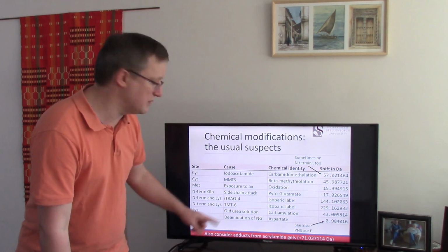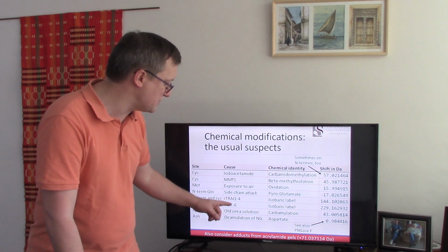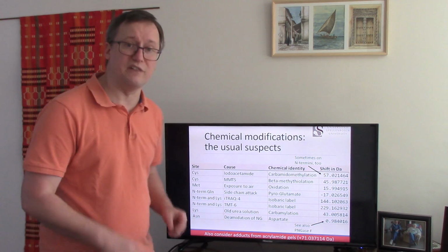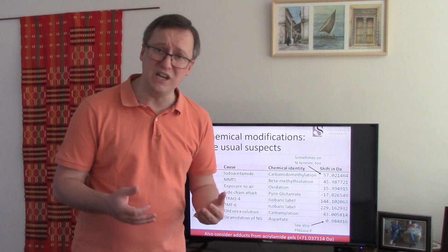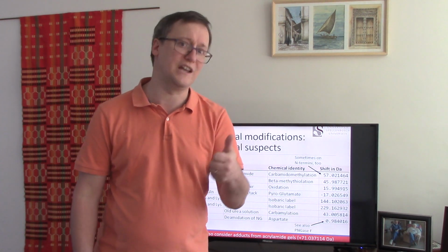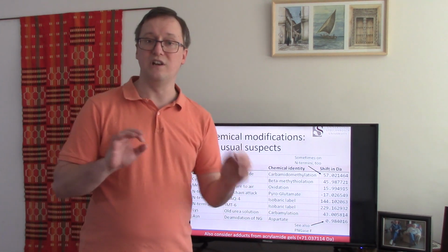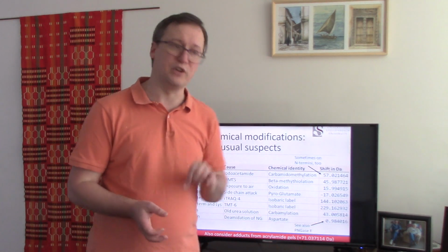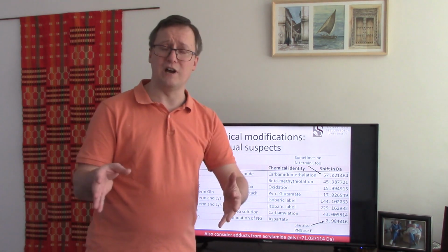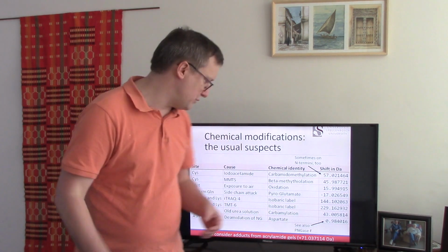Okay, we mentioned isobaric labeling for quantitative experiments. If you must consider these, remember that the iTRAQ and TMT reagents do not just alter the N-terminus of the peptides, they attack primary amines, and a primary amine is also found in a lysine side chain. So if you do an iTRAQ or TMT search, you'd better remember to put it not just on N-termini, but also on lysine. And of course those two have different masses, plus there are other isobaric tags out there. iTRAQ is also available in an 8-plex form, for example.